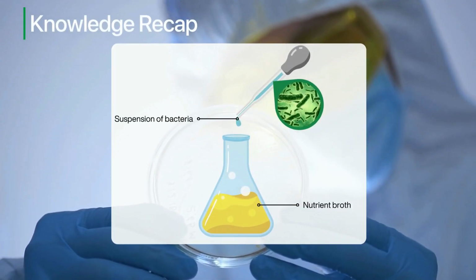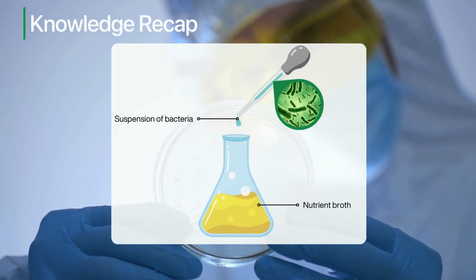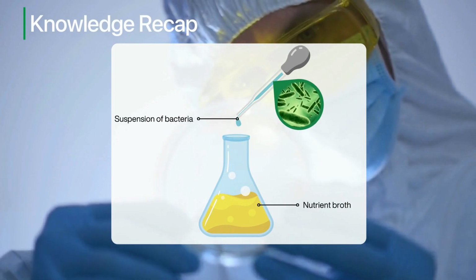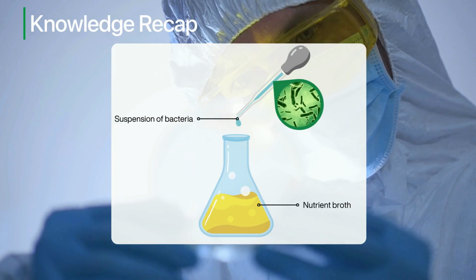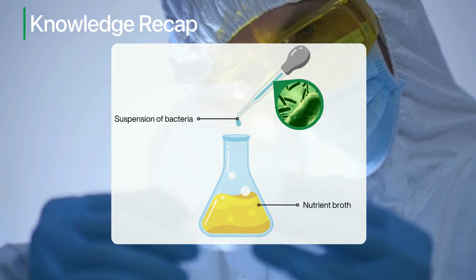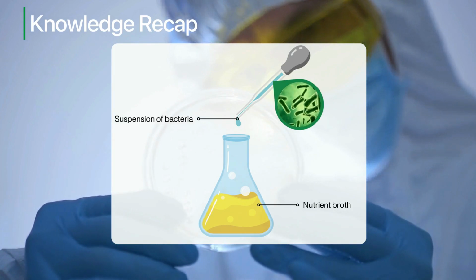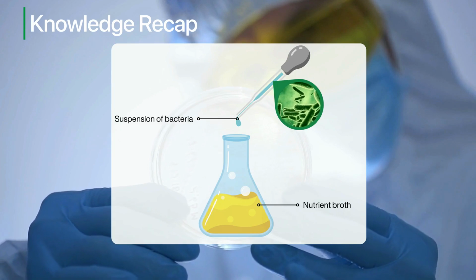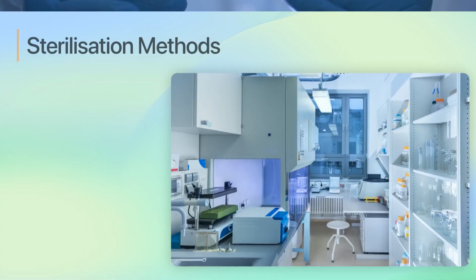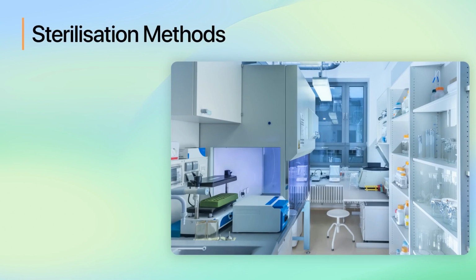So far, you have learned the steps required to culture bacteria in the lab. This foundational understanding includes knowledge about the different growth media, incubation conditions, and basic lab procedures needed to support bacterial growth. Building on this foundation, today's lesson will uncover how these aseptic techniques are applied to advance your skills in microbiology. Now, let's dive into the core of today's lesson, the aseptic techniques used in culturing microorganisms.